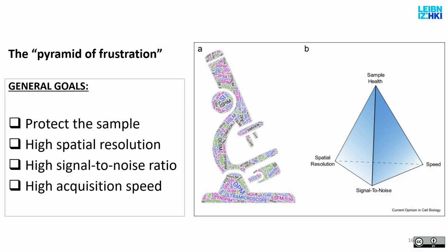And the reason why I always recommend to colleagues, even in biology, to learn about image analysis is that you know what you can do afterwards. Because that will tell you how good you have to be with your microscopy images. And again, you cannot be perfect and you don't have to be perfect. You can do a lot afterwards.